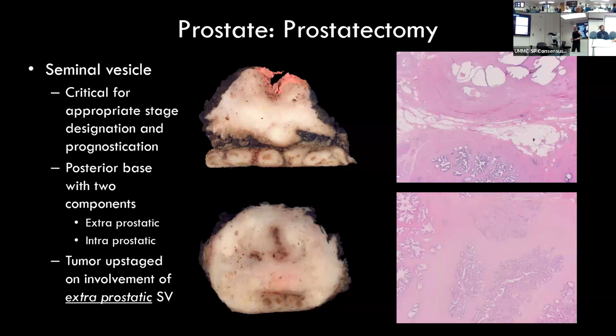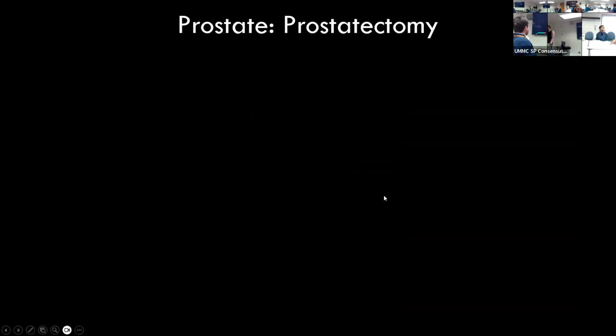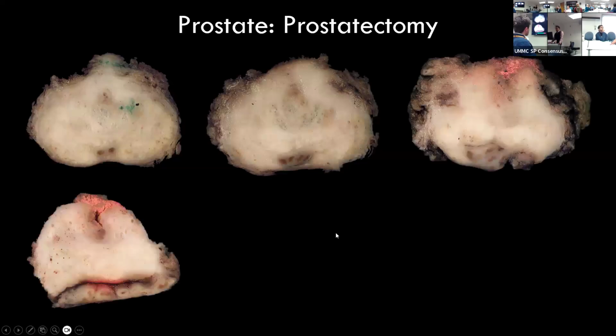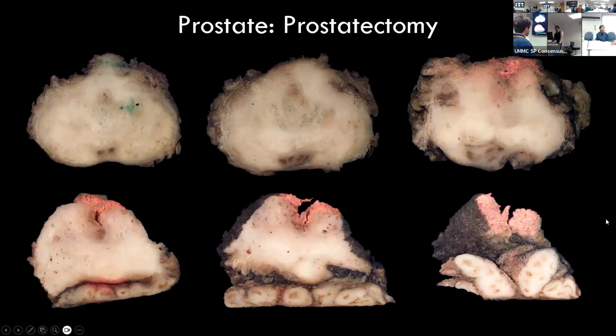Is it worth it to take a photo like that when you're grossing it, like how we do with breast? Sure, you can. Just so you have a gross core. Yeah, you can do that. But the key thing is to understand when you're grossing what's intra and extraprostatic and submit appropriately.